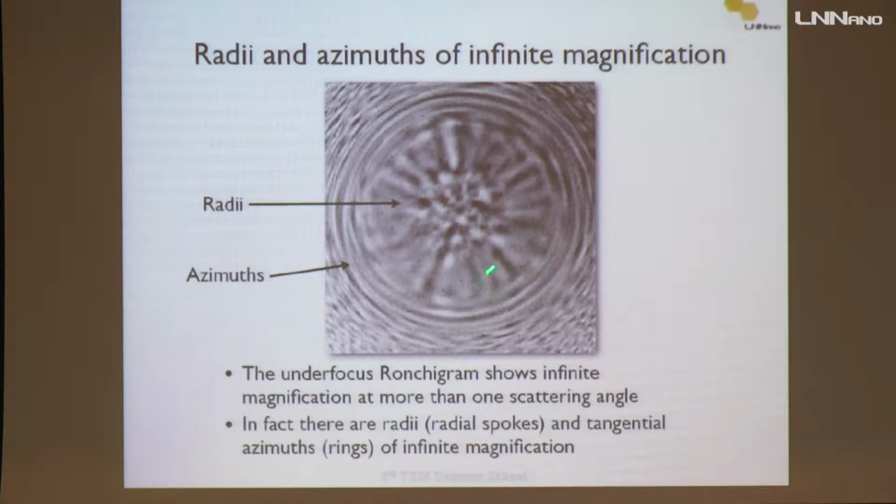We can put an aperture here to limit the amount of electrons arriving at your probe, limiting the amount of aberrations that you put in your probe. This is what we try to do.